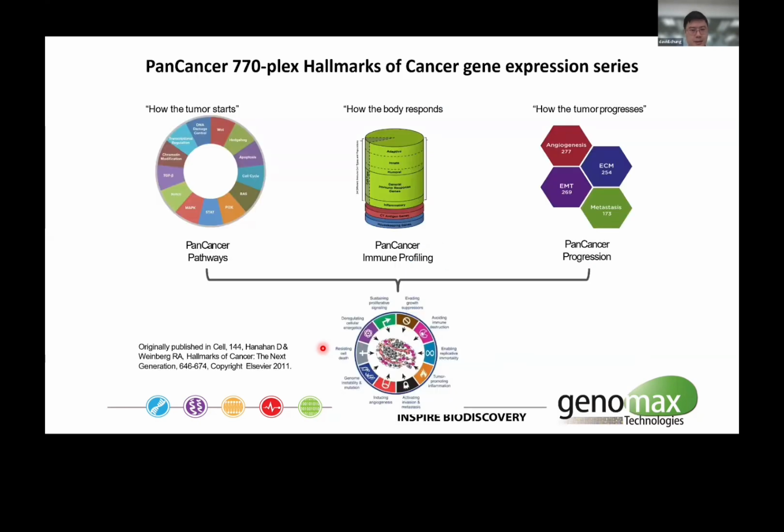So in the last part of my talk, I'll just quickly brief you through some of the gene expression panels currently offered by Nanostring on their catalog. These panels are usually carefully curated by their scientists. Based on the publications, the genes that are reported to be clinically relevant will all be included in the panel.